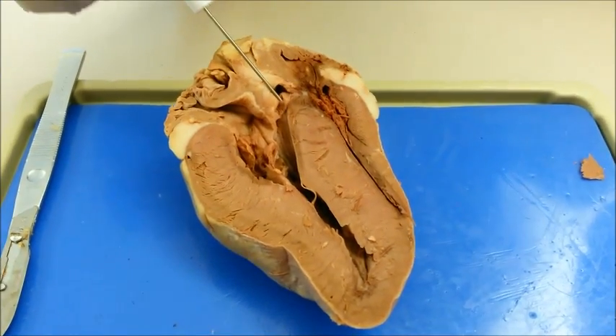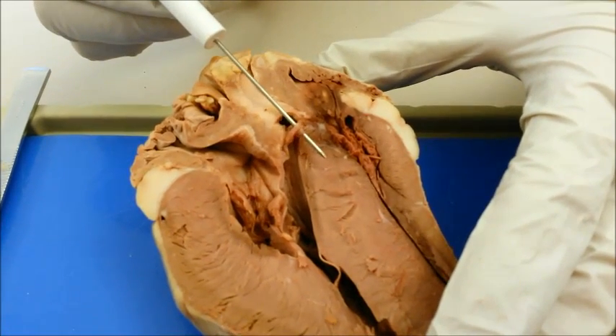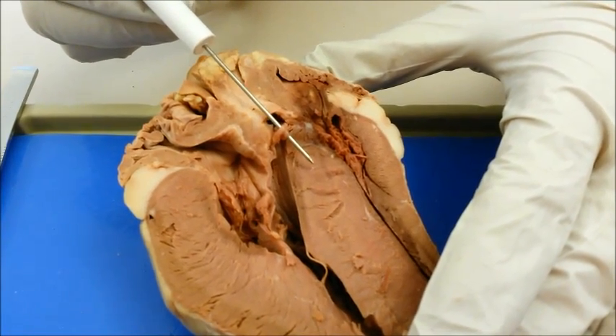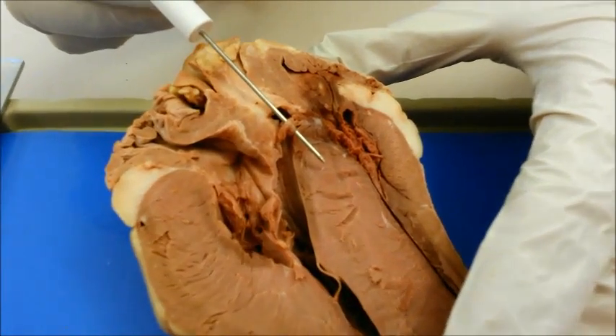The aortic semilunar valve is located between the aorta and the left ventricle. It is a flap of endocardium and connective tissue reinforced by fibers, which prevent the valve from turning inside out. It gets its name due to its half-moon shape.